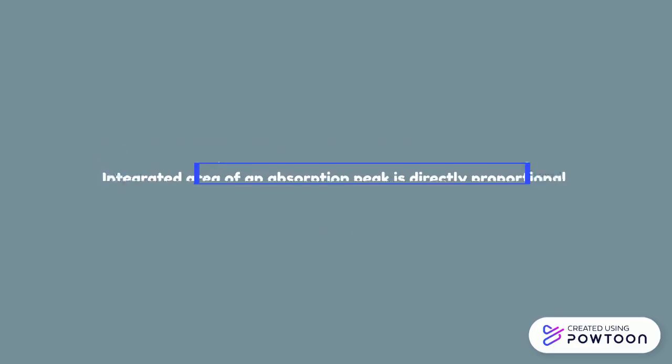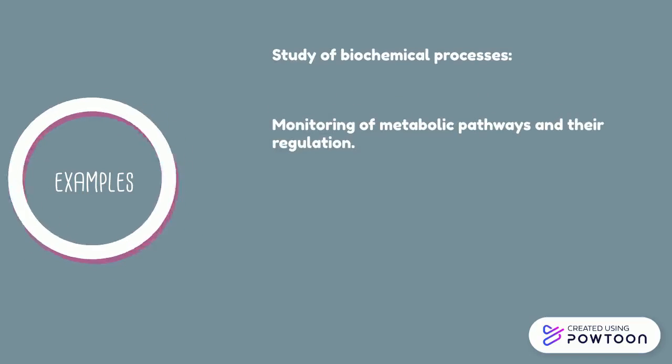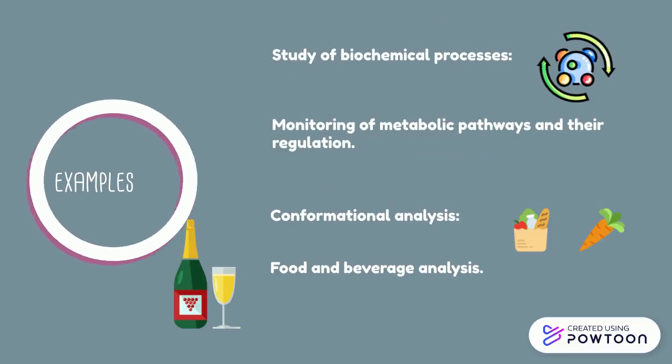NMR spectroscopy can be applied to study the structure and dynamics of organic and organometallic compounds and biomolecules. Some examples are its use in medicine for the monitoring of metabolic pathways and their regulations, and in other areas for the analysis of food and beverage, among others.